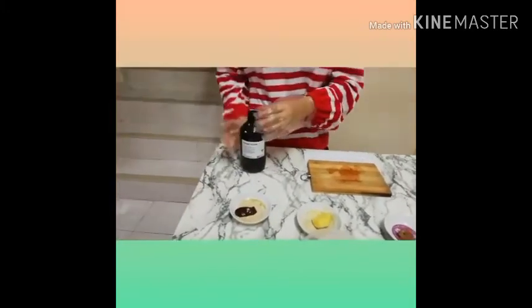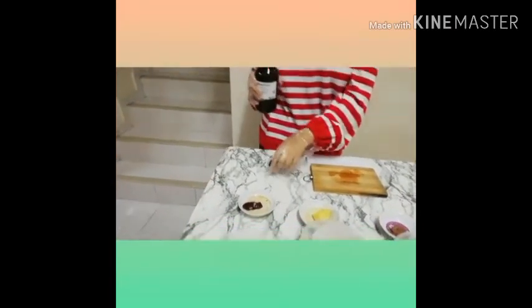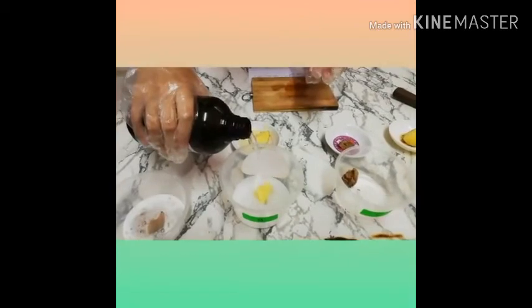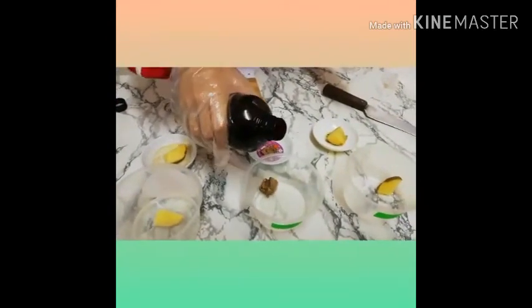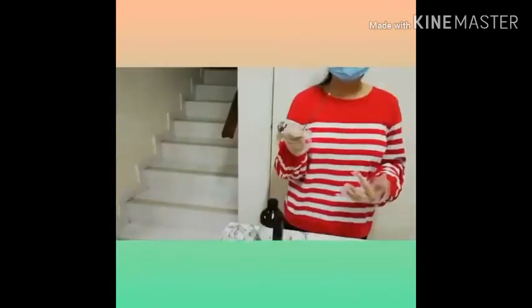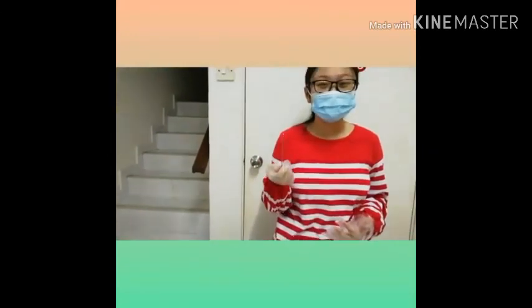Alright, fast forwarding from here. Add some hydrogen peroxide into the containers. And remember, be very, very careful. Okay, there is no reaction happening here. Also here.